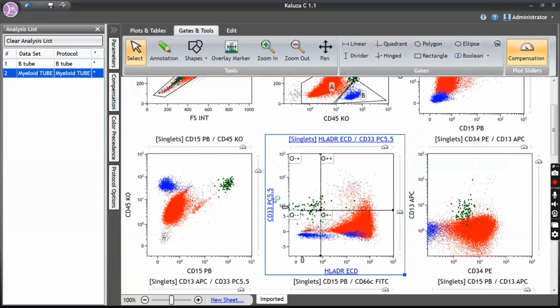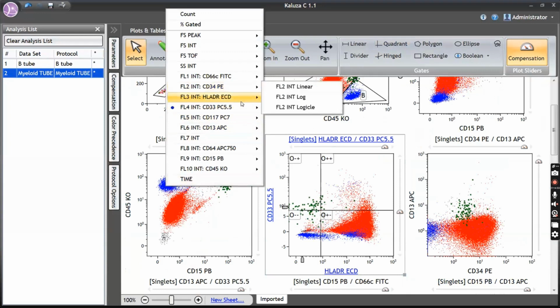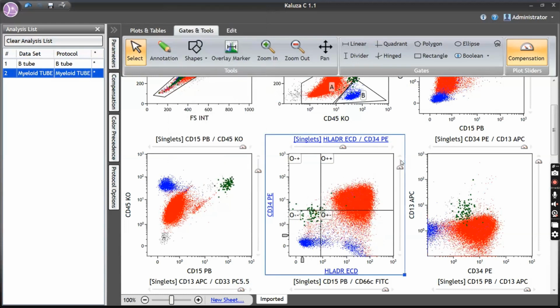Okay. So, sir, can we use HLA-DR to differentiate between B lymphocytes and T lymphocytes for internal control? Yeah, you can definitely use it, but I'm saying T lymphocytes, when they get activated, can show HLA-DR expression. So you will not find that homogeneous expression of HLA-DR as seen in B lymphocytes. Okay, I'll show you. Now you see, these are B cells. You see that homogeneous expression. Whereas T cells in this case have not got activated, so it's fine. But when they get activated, they can trail up to here.